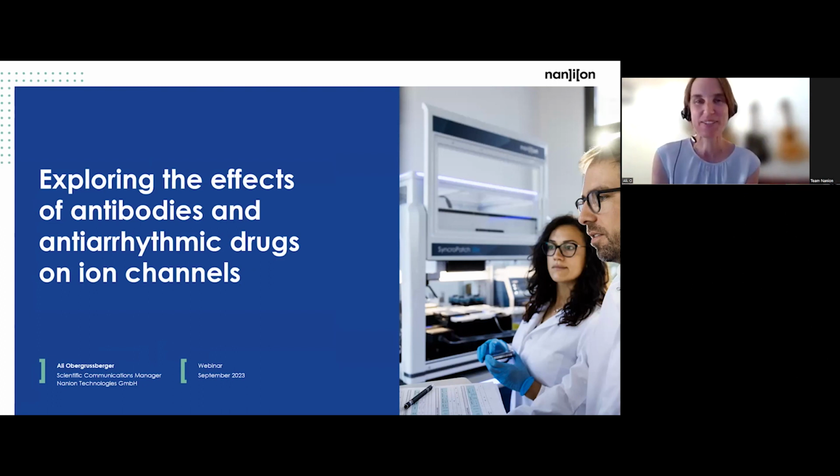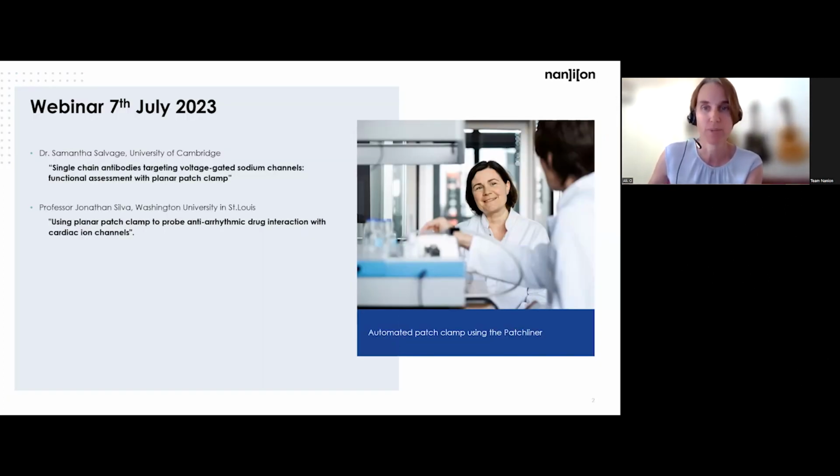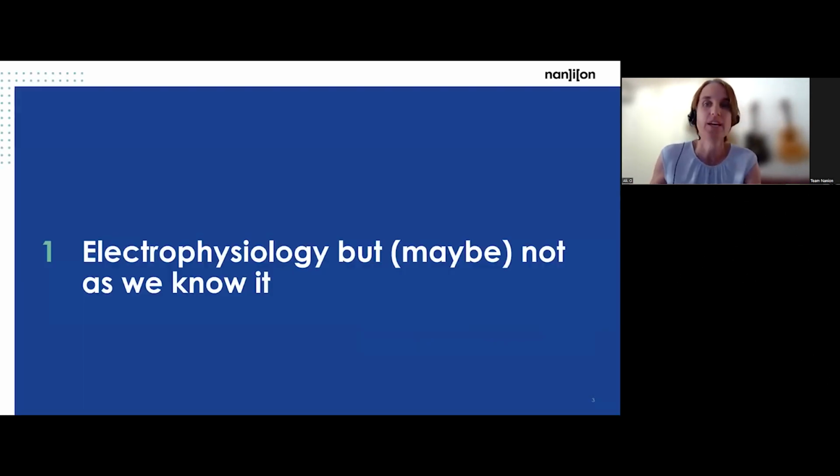Welcome everyone to this webinar this afternoon, or morning, I guess, depending on where you are, entitled Exploring the Effects of Antibodies and Anti-Arrhythmic Drugs on Ion Channels Using Automated Patch Clamp. As Jamar already mentioned, we're going to start off with Dr. Samantha Salvage from the University of Cambridge, and then after Sam's talk, we'll have a short Q&A session, and then we'll hear from Professor John Silva from Washington University in St. Louis. But before all that, I'm just going to give you a brief introduction into the world of automated patch clamp, and in particular the Patchliner, just to make sure that we're all on the same page.